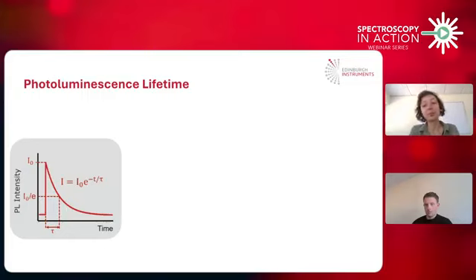And these are a complex mix of radiative and non-radiative relaxation pathways after you excite. And it's important for researchers to understand these processes so they can optimize further the efficiency of these probes. As I mentioned in one of the first slides, you might also want to characterize the lifetime if you're going to use them for imaging experiments like FLIM or PLIM microscopy.